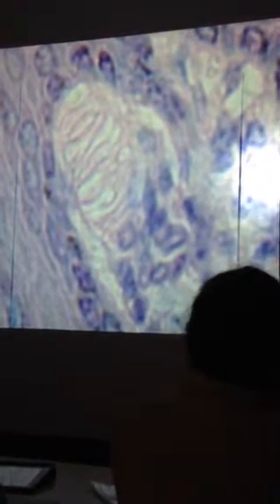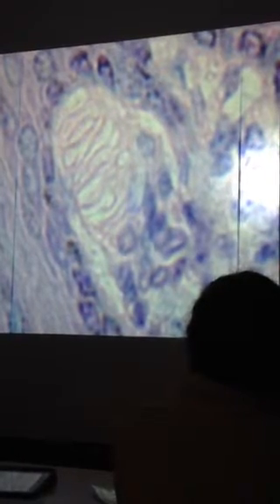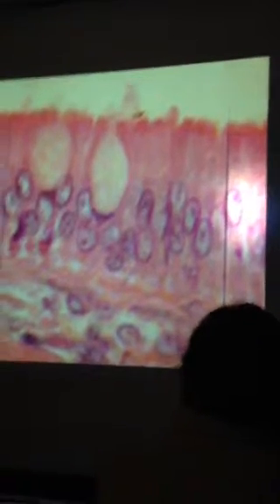That's classic. That's test quality. Again, if you don't know this, just hand in your test and take a 0. Okay. What is it? Okay, this is another one. If you don't know these by now, then you're in the wrong course. You ought to be that child that's left behind if you don't know. These are mucus-secreting goblet cells. You're recording this? That's fine. I stand by it.